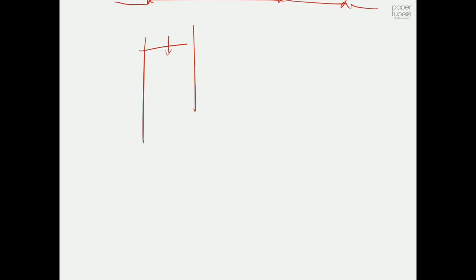So the dissolved phase will move through the column where we have our silica particles. As the liquid flows through the column, this liquid front is always exposed, no matter, it starts from the top to the bottom, it's always exposed to the silica particles, which are free of your analytes. Which means there is a concentration gradient. So that's the picture you have to keep in your mind.